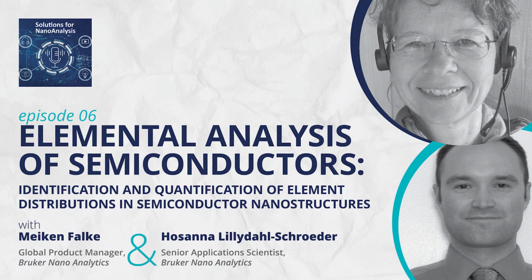So EDS has been used, as far as I believe, by many more people and in more industries, and it's broader spread, and there has been more effort put into a quick and simple EDS analysis. And maybe if there would have been so much power and so many companies dealing with EELS, some of the processes would also at least appear more simple, like a push button technique as in EDS. Yeah, that probably explains a couple of papers that I discussed with a customer doing battery research some time ago, saying they'd seen some very, let's call them creative diagrams showing excessive amounts of elements being deconvolved from an EELS spectrum. So that's a problem in any technique, I think.